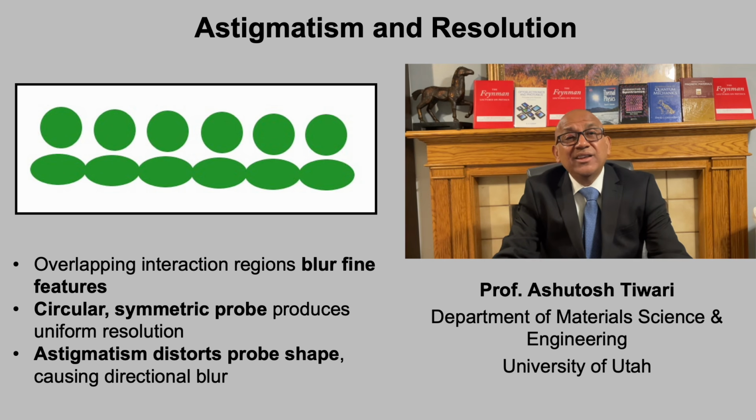The result is a directional loss of resolution. Even when accelerating voltage and detector choice are optimized, this is why beam stigmation is a routine and essential step in SEM alignment before acquiring high-resolution images.